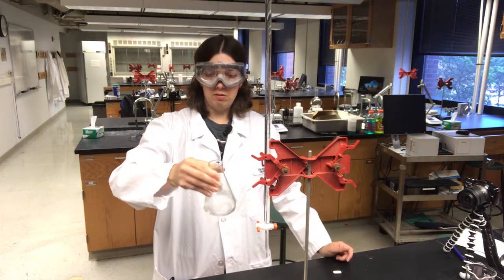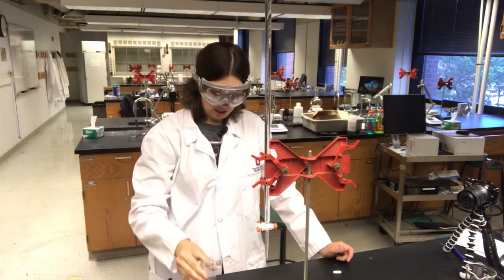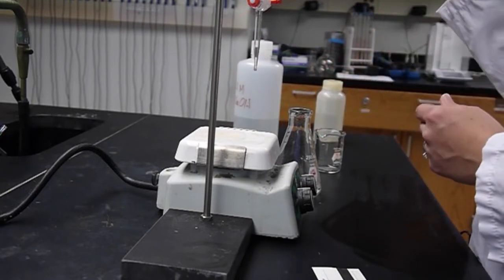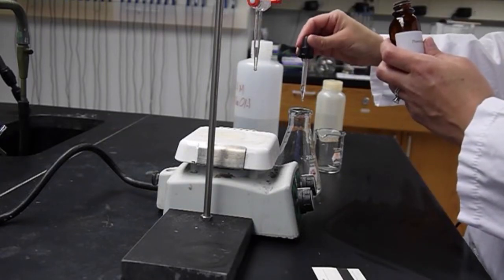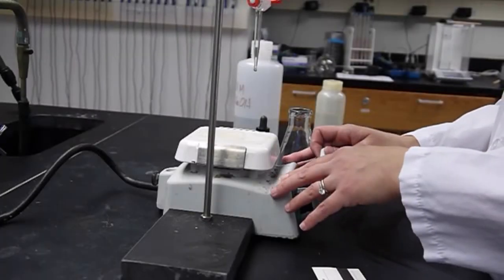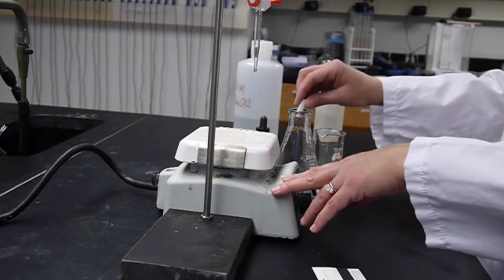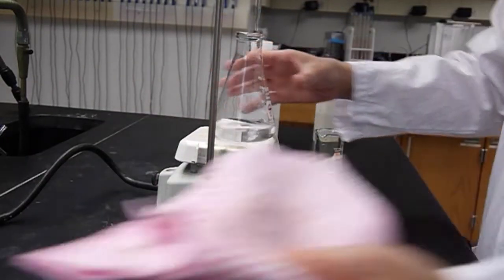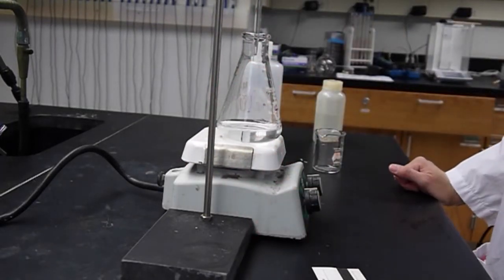I'm going to make sure that my KHP is fully dissolved — yes, looks good. Now I'm going to add phenolphthalein as the indicator: just two or three drops should be sufficient. I've set up a stirring hot plate to do my titration on. I'm not using the heat at all, but I am going to use the stirring feature. I'll place my flask on the plate and can put the burette tip right down into the flask itself.